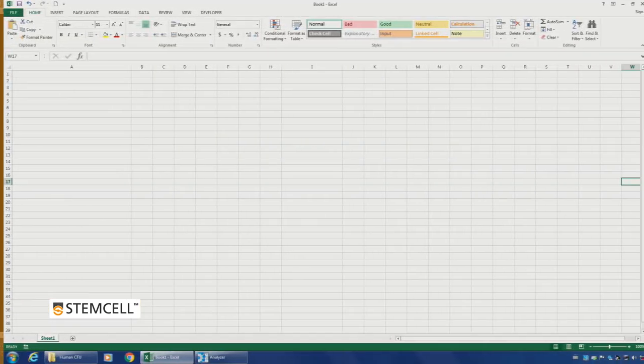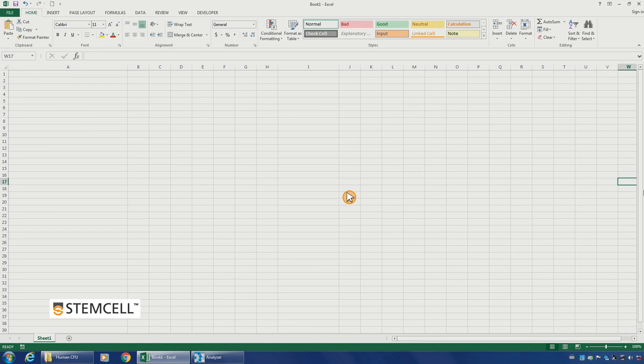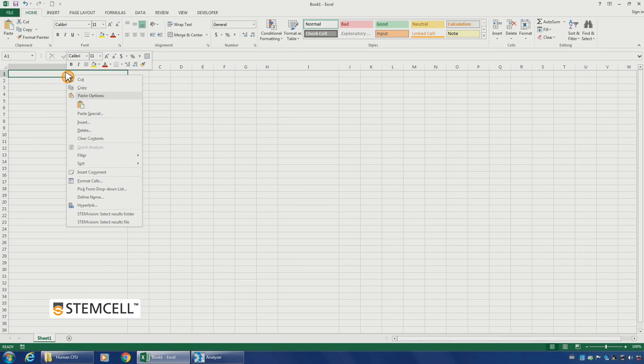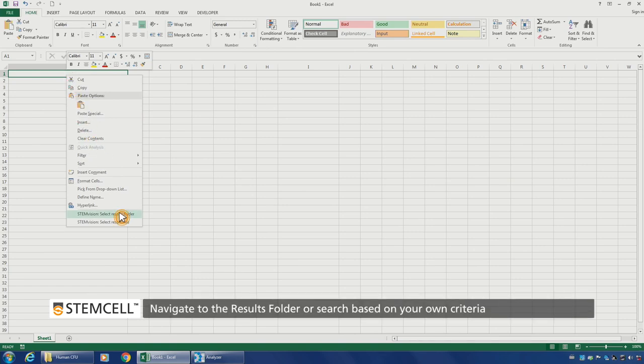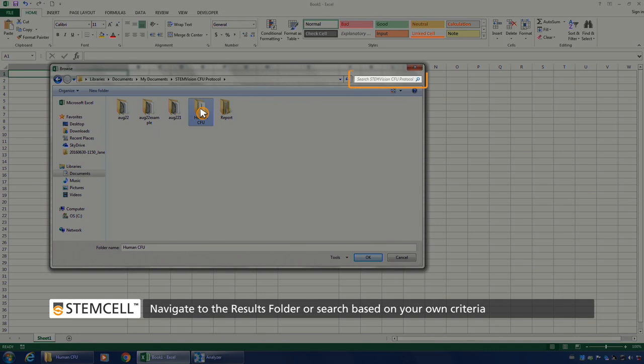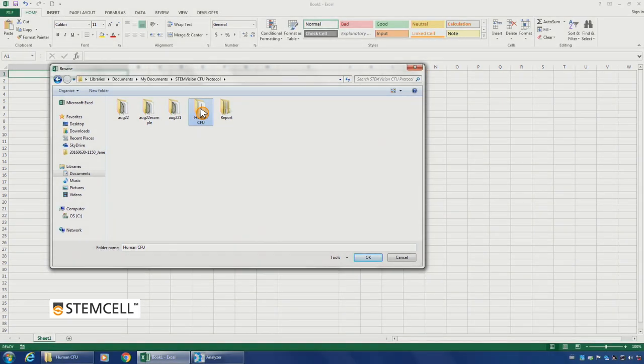If you wish to create a summary table for individual wells or plates, open Microsoft Excel and right click on an empty cell where the table is to be inserted. Select STEM Vision Select Results Folder from the drop-down menu, then choose the folder containing your results file. You can also generate a summary table by typing search criteria into the search box and choosing the results that match. Click OK to compile.